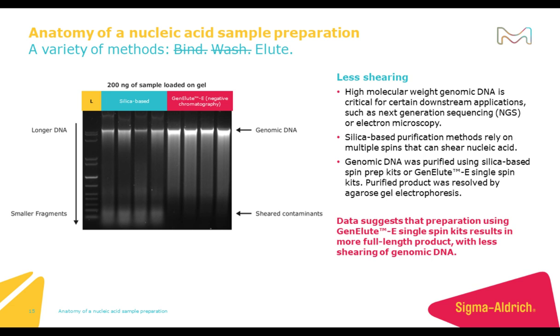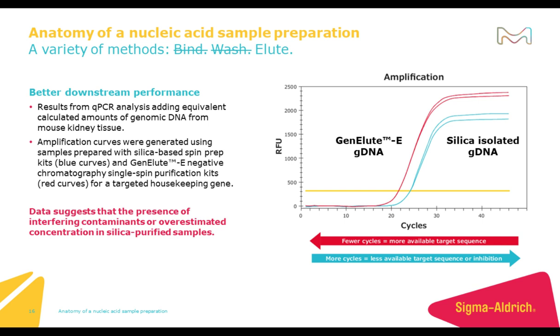Spinning the sample only once has other advantages as well. High molecular weight genomic DNA is critical for certain downstream applications such as next-generation sequencing or electron microscopy. Silica-based purification methods rely on multiple spins that can shear the nucleic acid. Shown here are four replicate samples purified either using a silica column or a GenLuE column — there is more full-length product on the electrophoresis gel for the GenLuE-purified nucleic acids. Additionally, these smaller fragments that could be due to shearing are often included in yield calculations and can give a false sense of how much template is being used in downstream workflows.